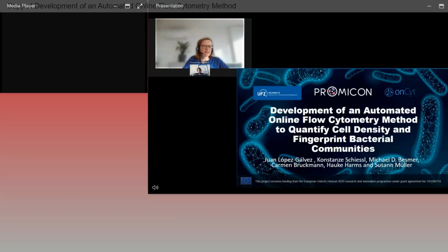We will be diving into the world of microbiology, and we will tell you about the great power of flow cytometry for achieving 3 things that are hidden in this kind of complicated title here. The 3 things are counting bacteria, differentiating bacteria in a mixed community, and tracking their dynamics over time. These 3 things may sound simple, but they're actually quite difficult to accomplish. We spent some time to develop a method for achieving this, and we will tell you about this today.